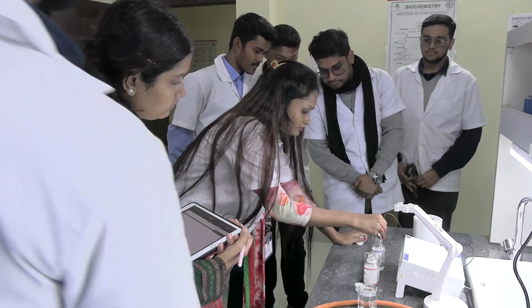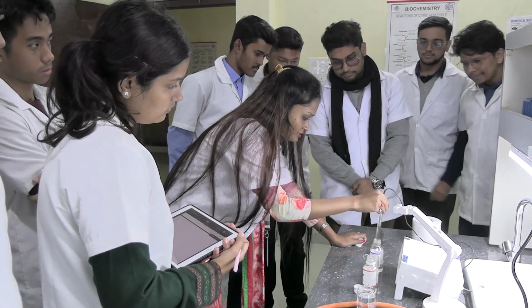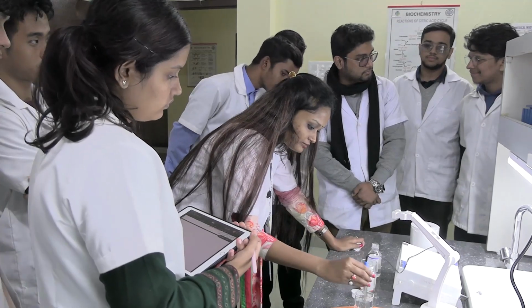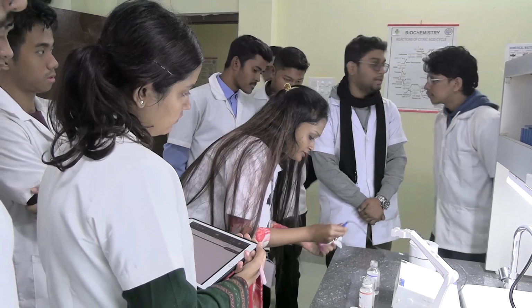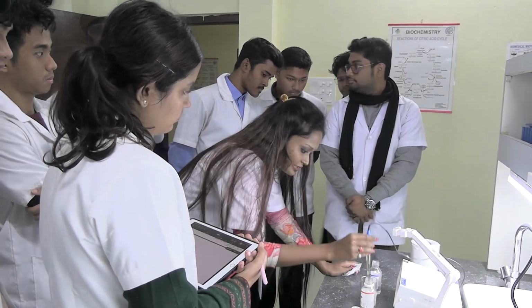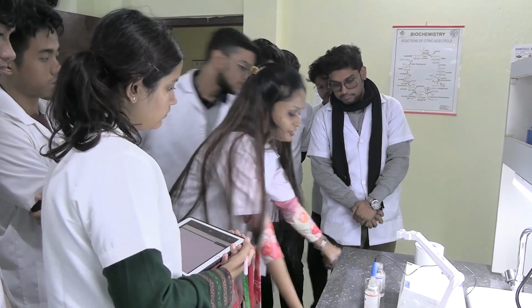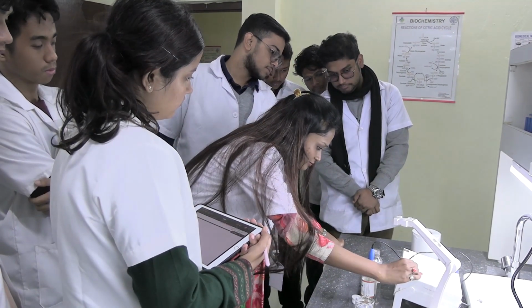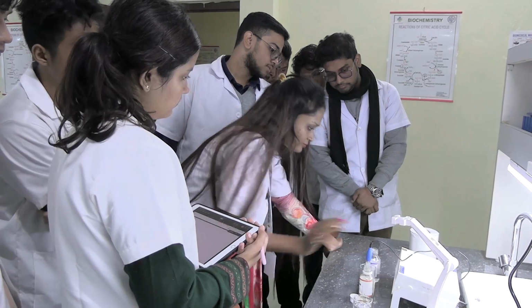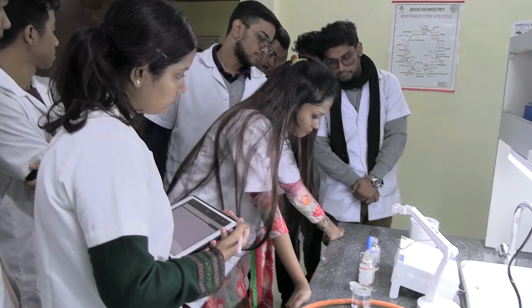Done? Now it's set. Now wash it again and wipe it. Setting pH 4. Now set. Done.